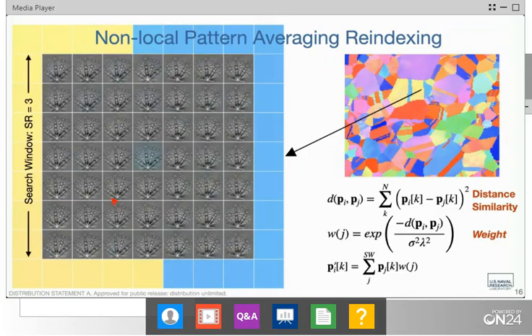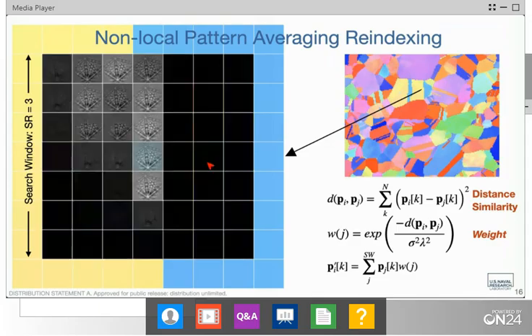Here are the patterns, and you notice that there's a lot of similarity between these patterns. It has a pseudo-symmetry type situation, right? Some of these poles are very much located in the same locations between the twin. There's some bands here that are very similar. So can this effectively differentiate between those two sets of patterns? Again, if we're just looking at these high-quality patterns, it's not much of a challenge. It certainly does a very good job.